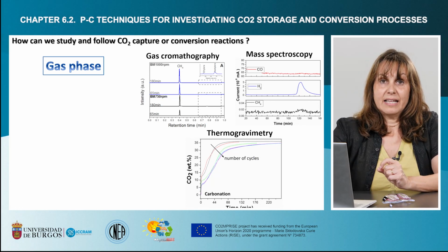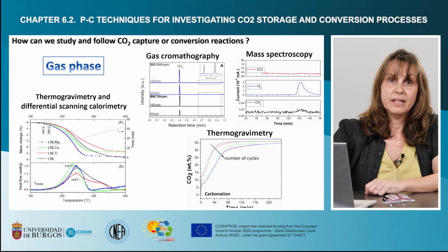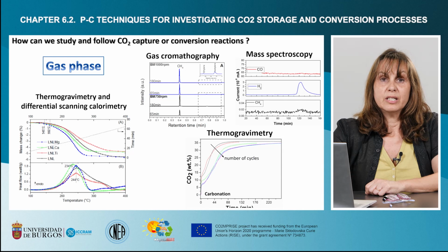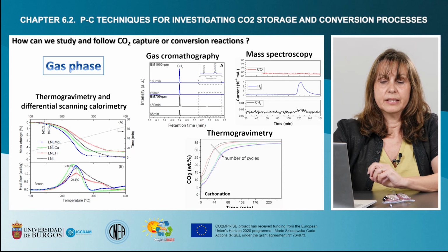The technique that allows us to follow this reaction is thermogravimetry. Another important technique is the combination of thermogravimetry with differential scanning calorimetry, because it's possible to correlate the change in the weight with the different absorption and release of heat.